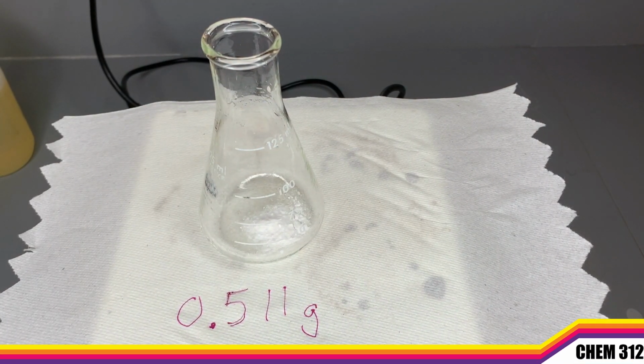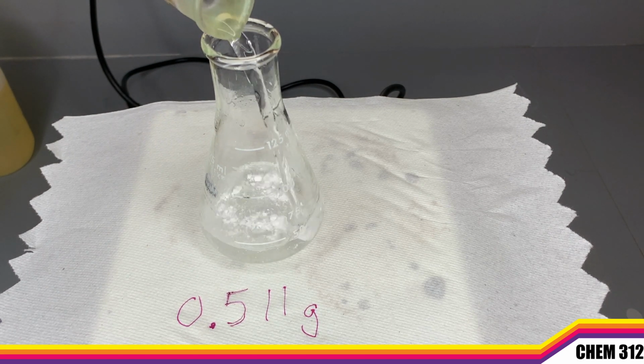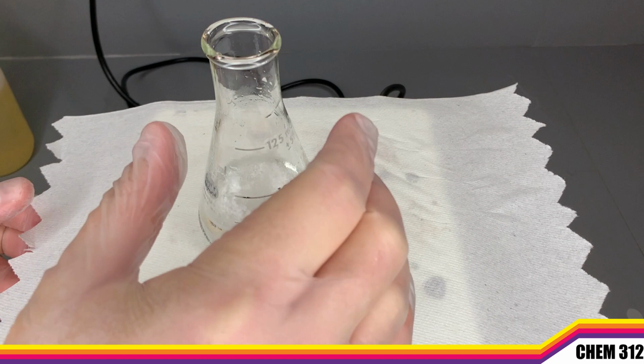Now I'm gonna add about 45 milliliters of water. And as we saw last week, we know that salicylic acid is not very soluble in water. So I'm actually gonna see pretty much all of it just kind of floating and hanging about in solution. And I'm gonna go ahead and start heating this now. So again, that idea of recrystallization is that the solubility of a solid increases as the temperature increases.